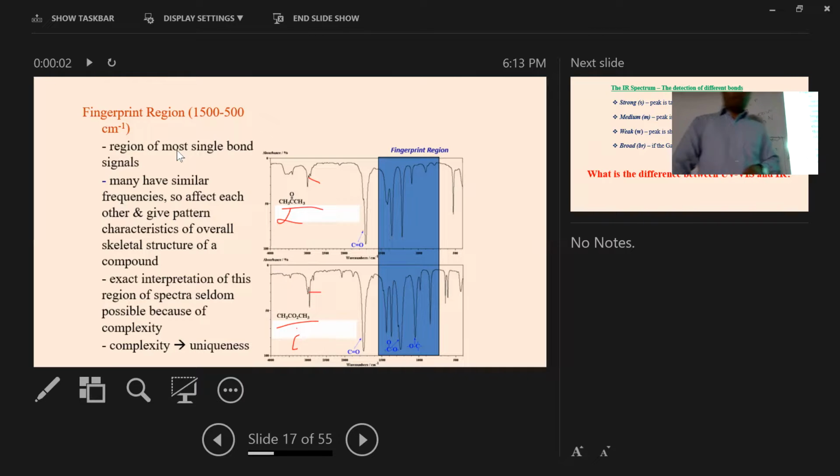Baseline? Okay. So baseline means where it is very similar to the axis. It is parallel to the axis. So here we can consider this is our baseline. This is also our baseline. So we should not have any absorbance in this region.